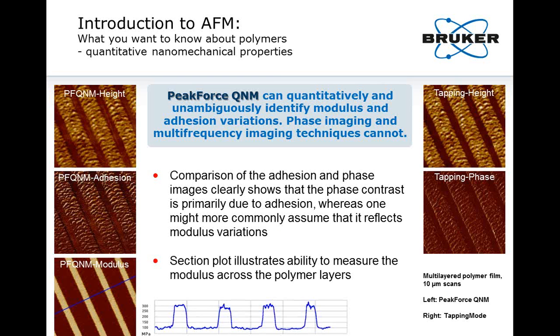And AFM can go significantly beyond just imaging topography. That's illustrated in this slide on the left and right side with a number of images of a multi-layered polymer film. On the right side, we see tapping mode images. When we introduced tapping mode imaging about 20 years ago, it was noted quickly that the tapping phase images, reflecting energy dissipation in the tip sample junction, must have something to do with mechanical material properties.